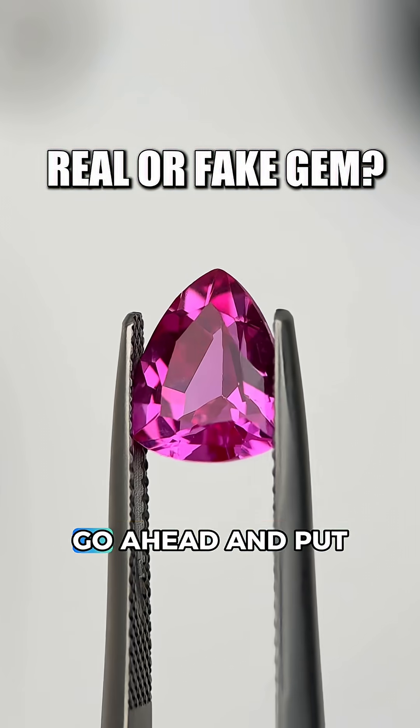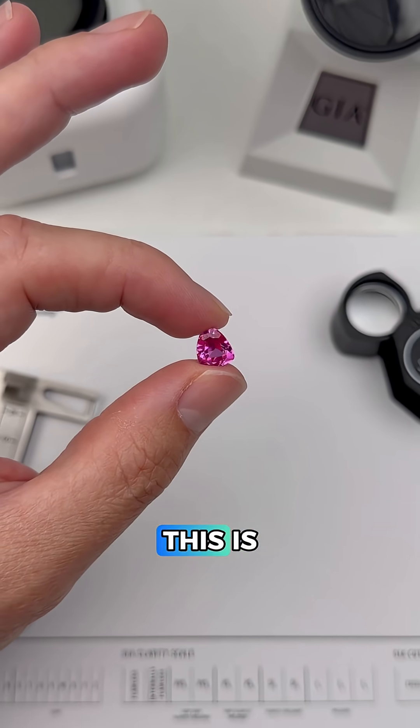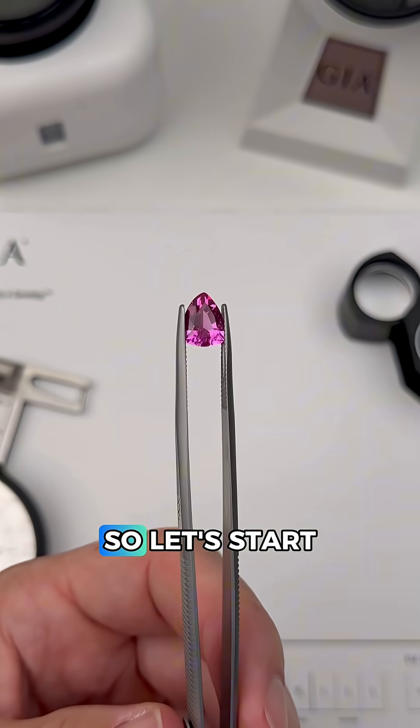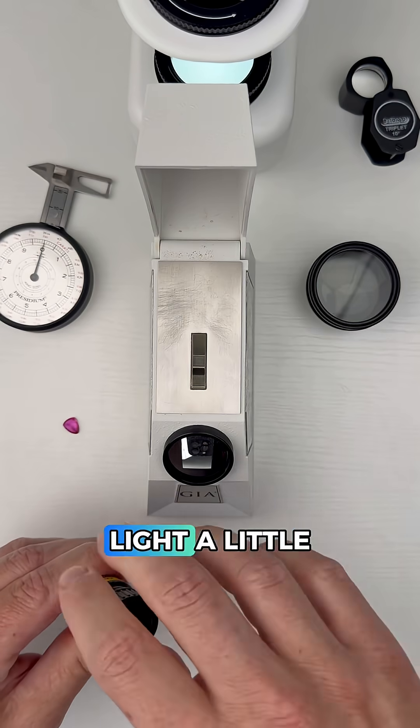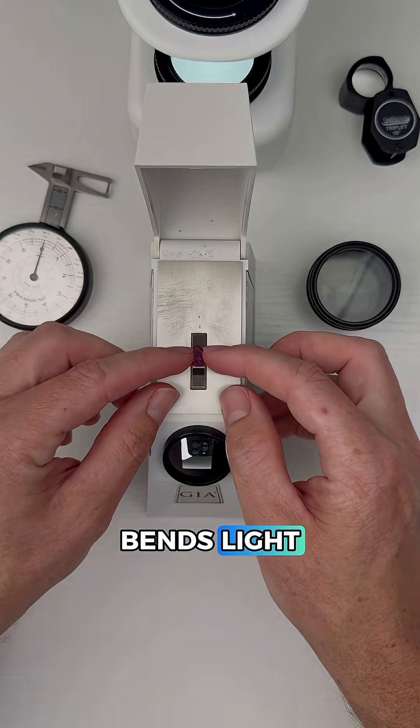Is this a real or a fake gemstone? Go ahead and put your best guess in the comments and I'm going to show you how a gemologist figures out what this is. This gem has a lovely pink color so let's start testing. Since all gems bend light a little differently, we're going to start with the refractometer to measure how this gem bends light.